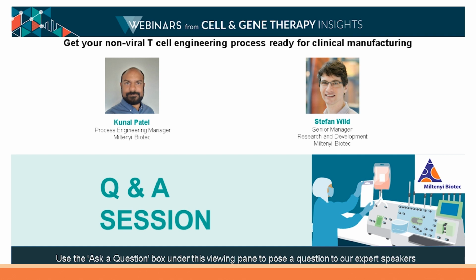Brilliant, thank you. And I think we've just got time to squeeze one more question in. It's a quick text-based one, so perhaps one for Stefan. What is the size of the cuvette, or the electrode gap, that is compatible with the system?